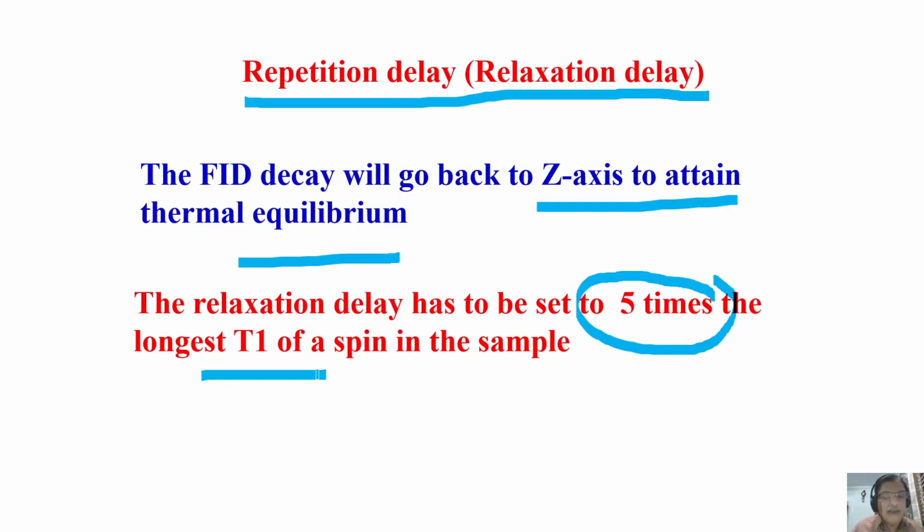So it is an exponential function. Put t equal to T1, what happens? It turns out to be 0.67. If t is equal to 2 T1, like that you calculate. T by T1 is there. Make it equal, then double, then triple, find out.